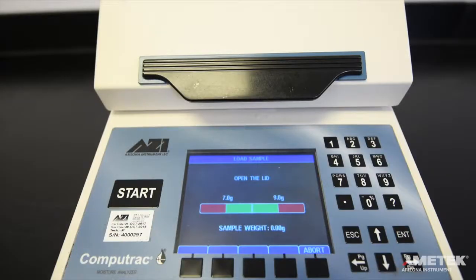Once the instrument is finished taring the empty pan, a red and green bar graph will appear, along with a prompt to open the lid. The bar graph provides a visual indication of how much sample is acceptable for a particular test program. In this case, eight grams plus or minus one gram is acceptable and in green. Anything outside of this range is represented by the red part of the graph.